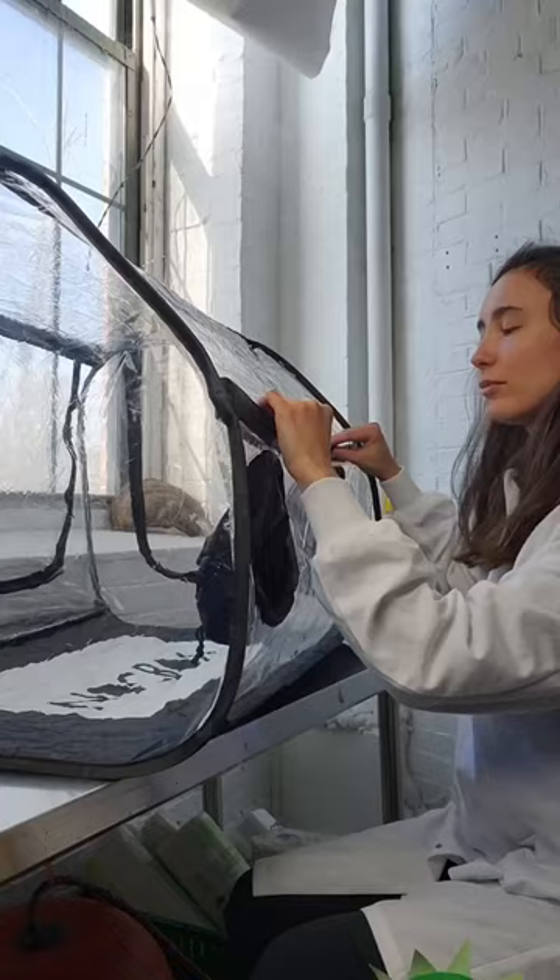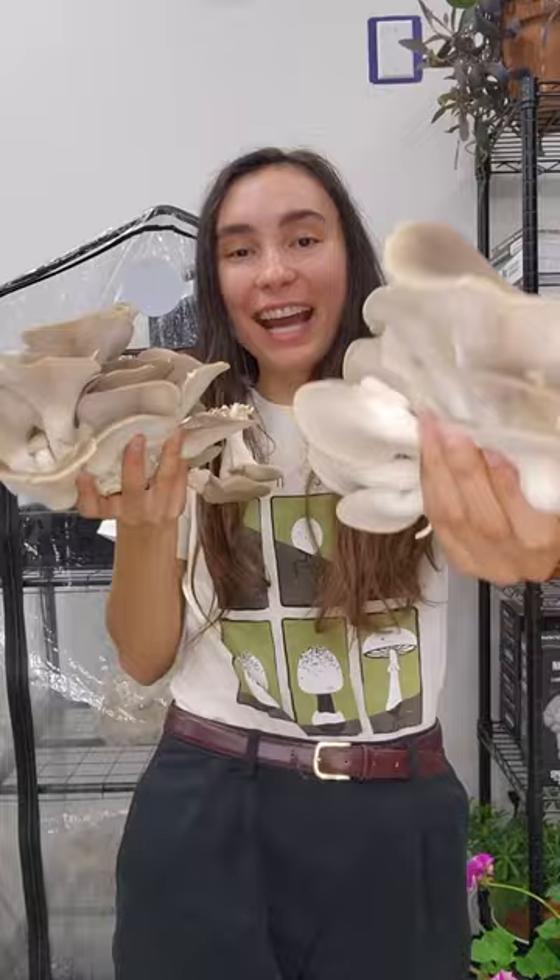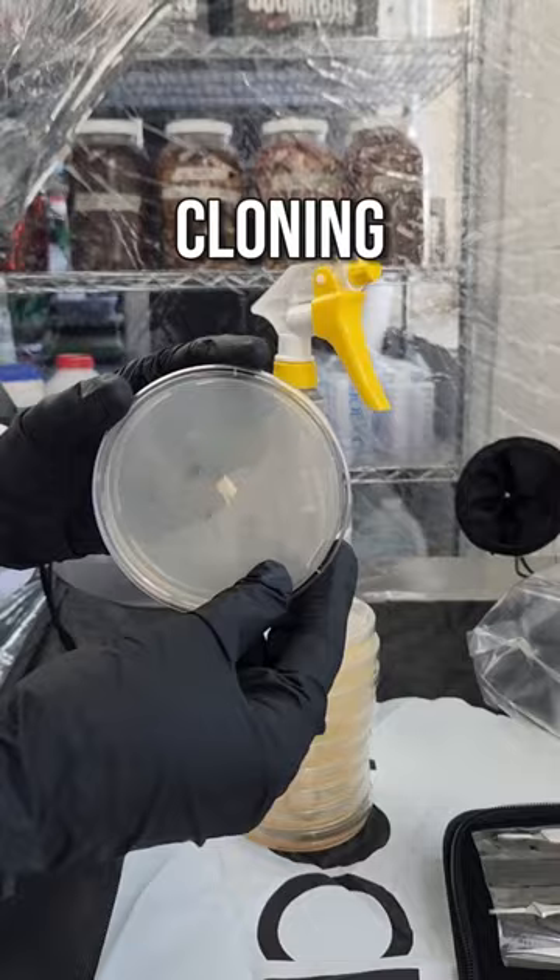The knockbox restricts airflow, limiting contact with airborne contaminants, which increases your chance of success. You can use the knockbox for various mycology projects including mushroom cloning, monotub inoculations, and sterile grain or all-in-one inoculations.